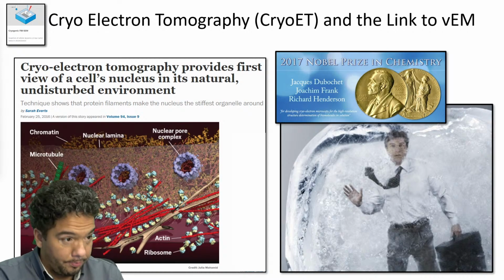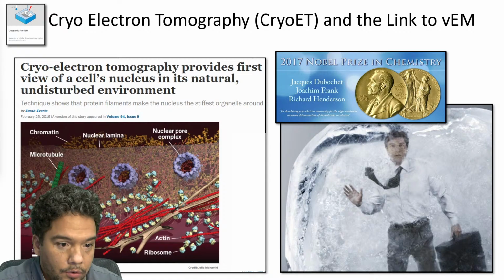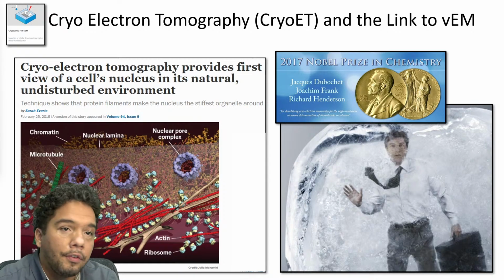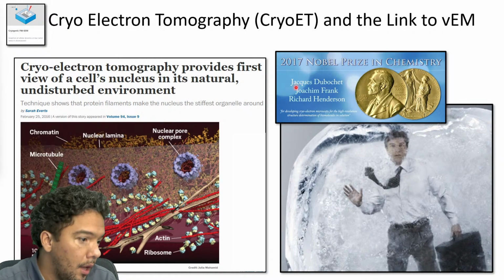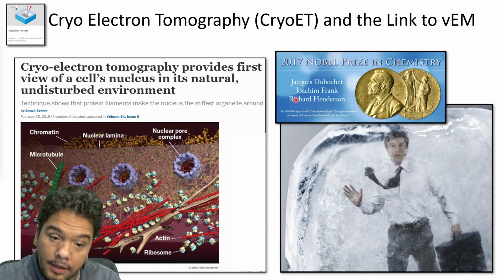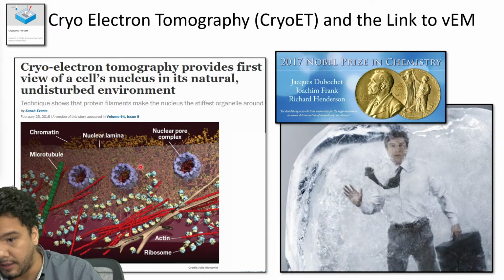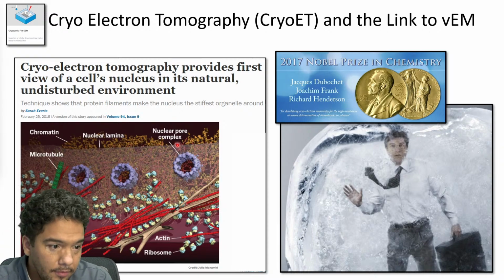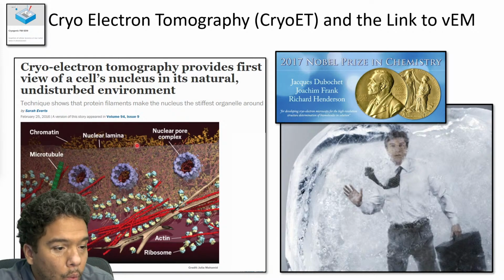A brief background about these techniques. In 2017, the Nobel Prize was granted to three people, Jacques Dubochet, Joachim Frank, and Richard Henderson, for the development of these techniques. Here you can see a really nice overview of what these results look like.